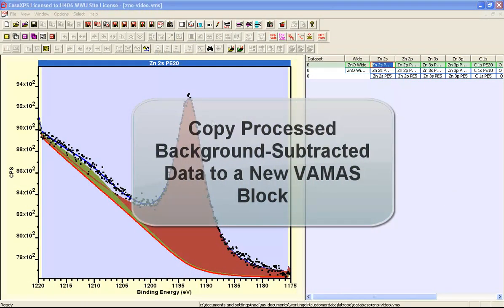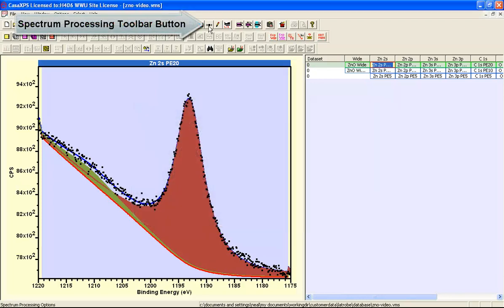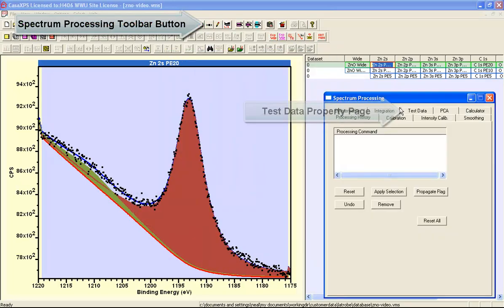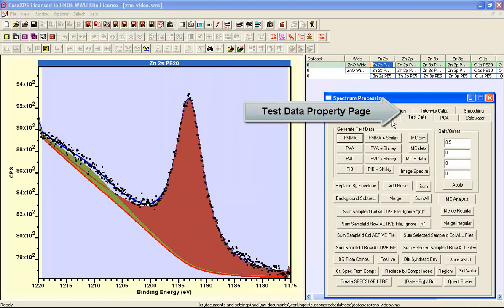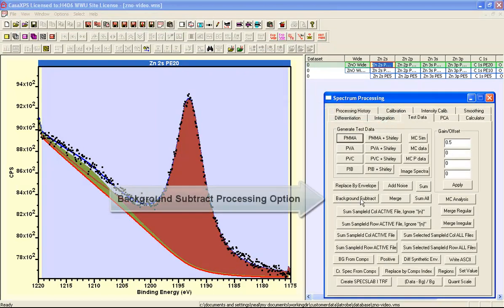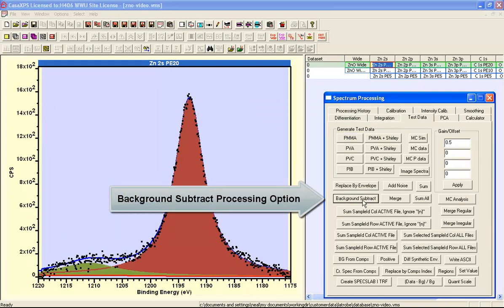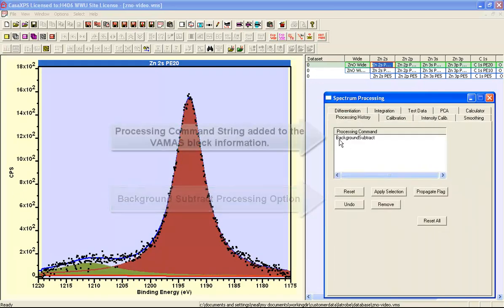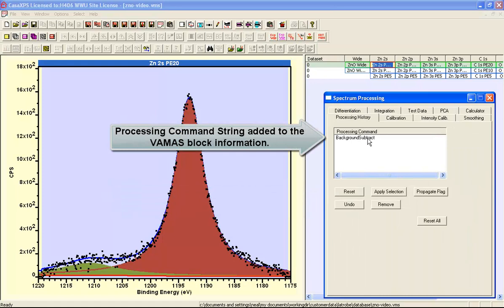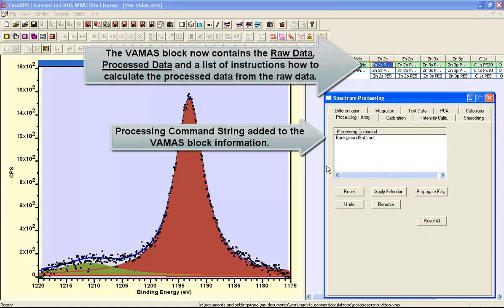In this video we're going to background subtract these data using a processing option on the spectrum processing dialog window. The test data property page gives us an option that says background subtract, and when we press this option, the processing history indicates that an instruction has been performed on the raw data that has removed the current background.